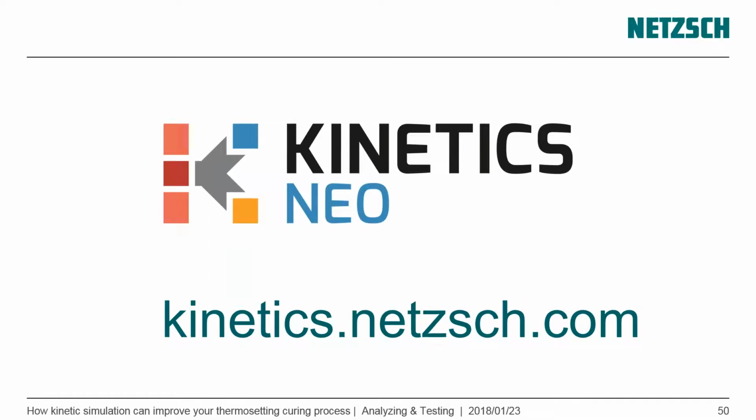So now I'm open to your questions. I will have a look at the questions that reached me during this webinar. There was a question of Dami Kim. My question is how to calculate the activation energy if the nuclei of samples are exchanging during heat treatment.